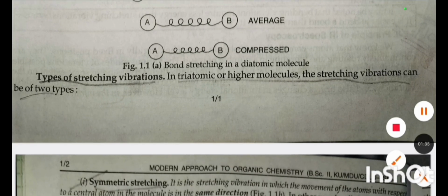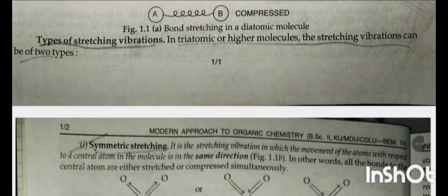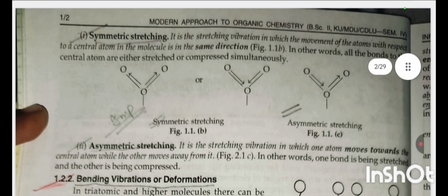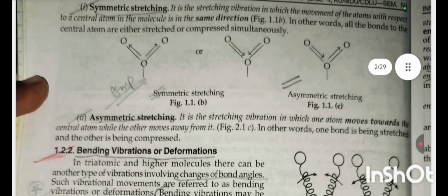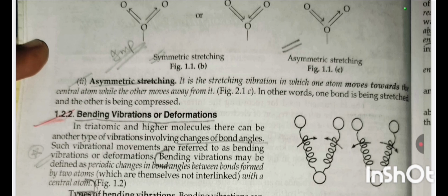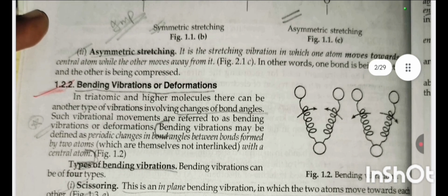Types of stretching vibrations. In triatomic or higher molecules, the stretching vibration can be of two types. First, symmetric stretching. It is the stretching vibration in which the movement of atoms with respect to a central atom in the molecule is in the same direction. In other words, all the bonds toward the central atom are either stretched or compressed simultaneously. Second, asymmetric stretching. The stretching vibration in which one atom moves towards the central atom while the other moves away from it. In other words, one bond is stretched and the other bond is compressed.